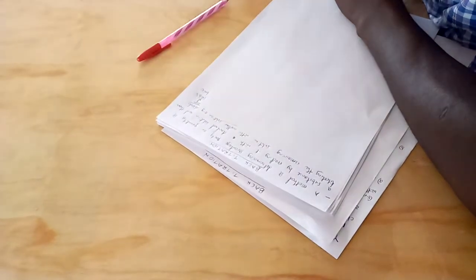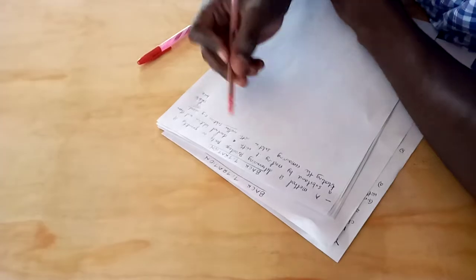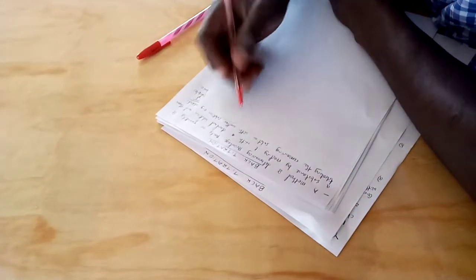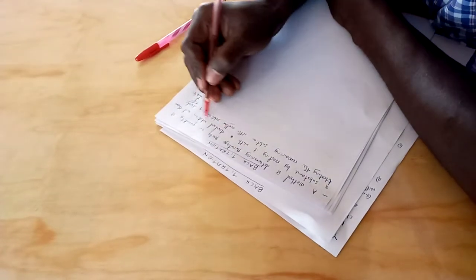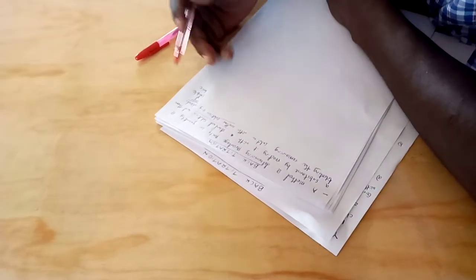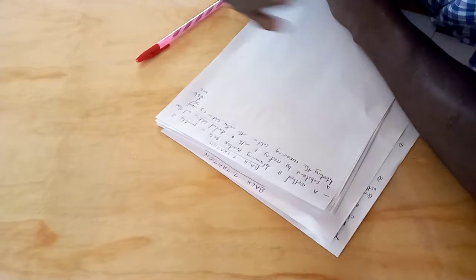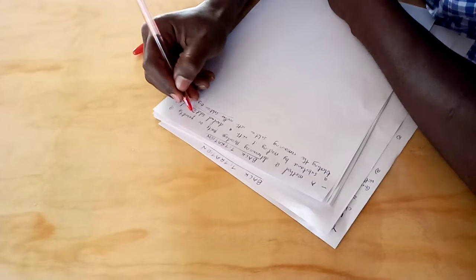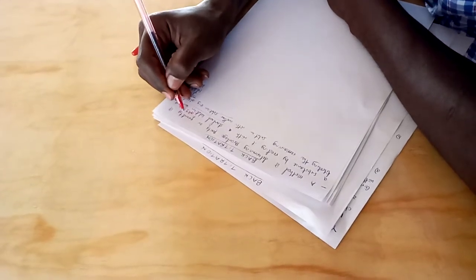So we are saying that we want to determine the percentage purity or quantity of a substance by reacting it with a standard solution. A standard solution is a solution whose actual concentration is known. So we can take here, for example, an acid.